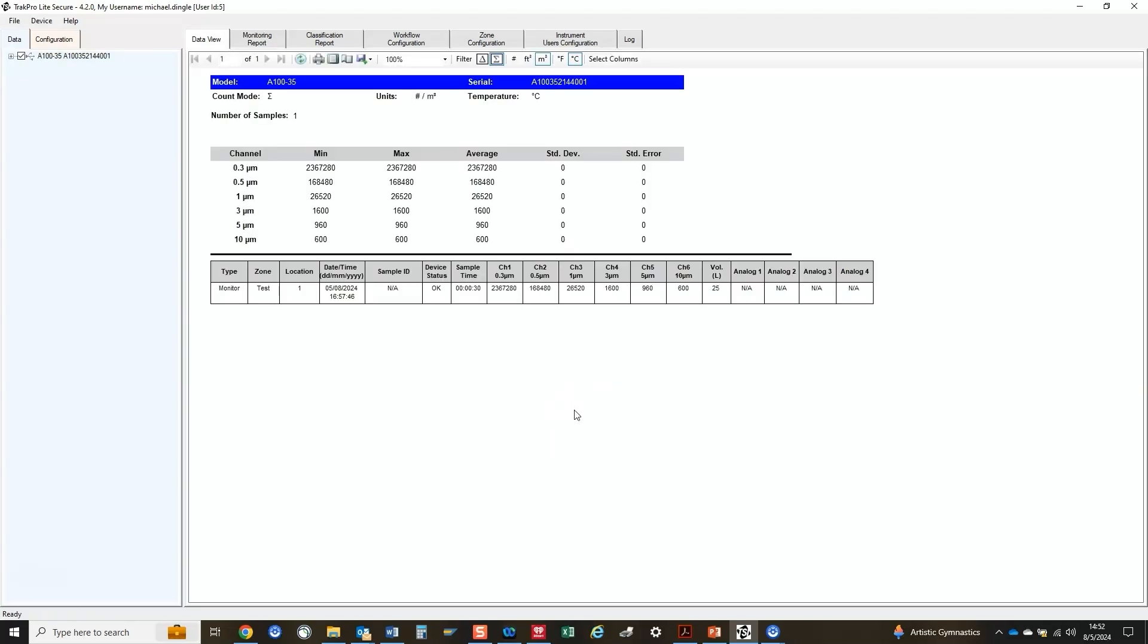Once the download is complete, you can view the data and generate reports. You can also save the configuration to load onto other instruments or update the configuration of the instrument that is connected.